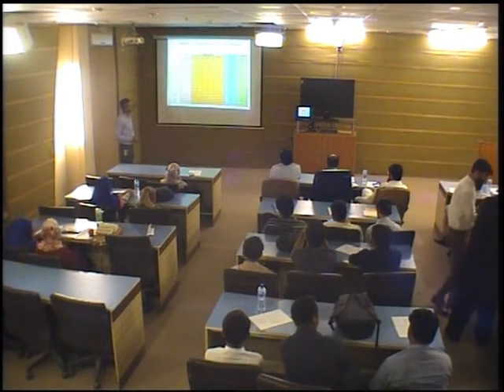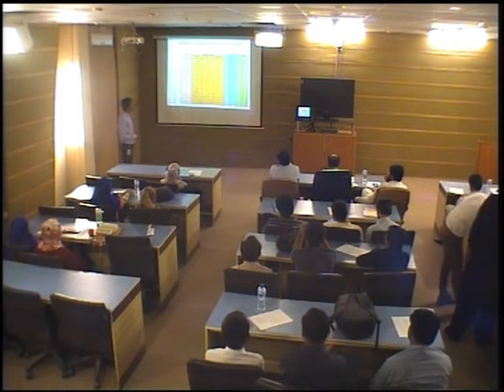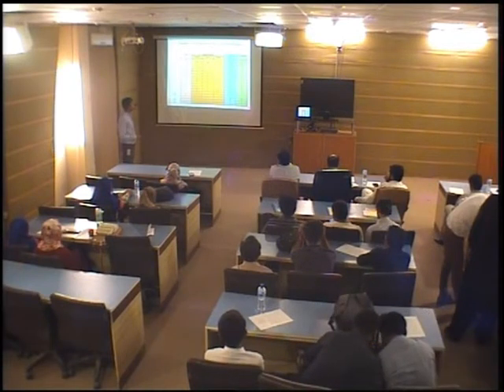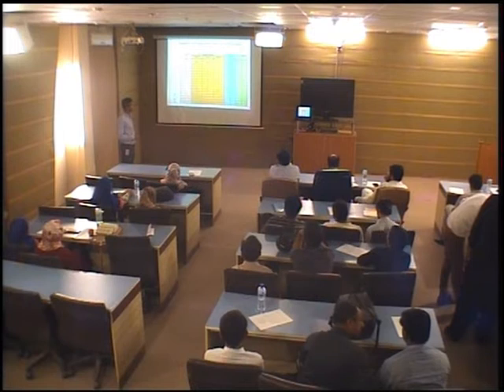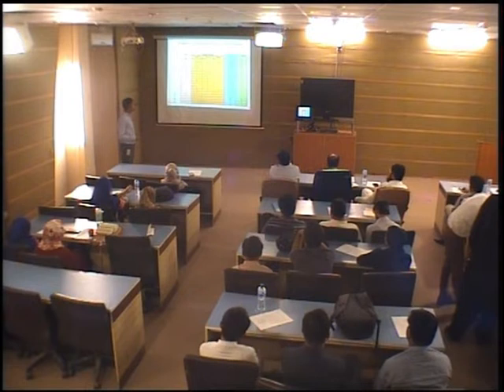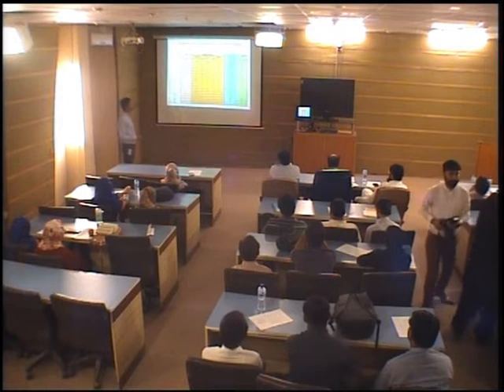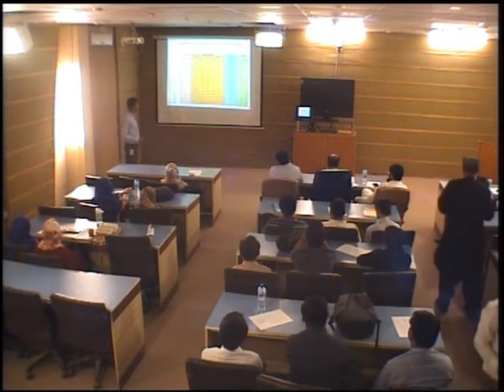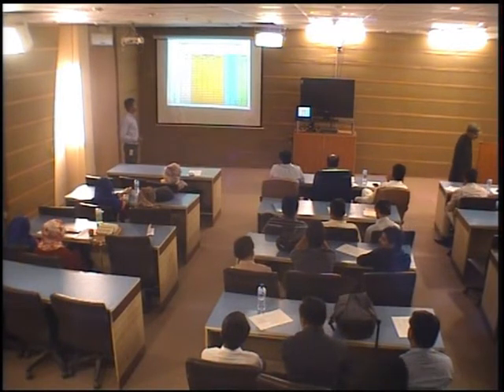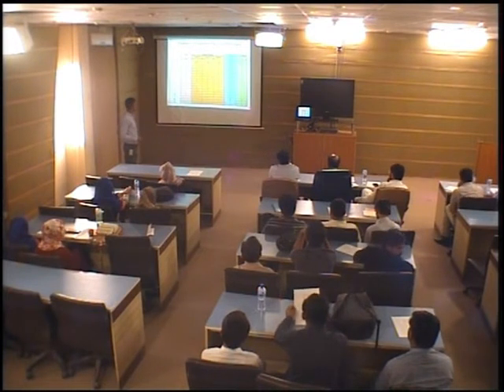So, number of emission lines in all samples. For coal, we have observed maximum lines of lead, almost 30 lines of lead, and for talcum powder sample A, we have observed 19 emission lines of calcium. For sample B, talcum powder, we have observed 42 lines of calcium, and for sample C, we have observed 19 lines of calcium. While for face polisher, we have observed maximum lines of titanium, almost 44 emission lines. While for eyeshadow, we have again observed 44 emission lines of titanium.